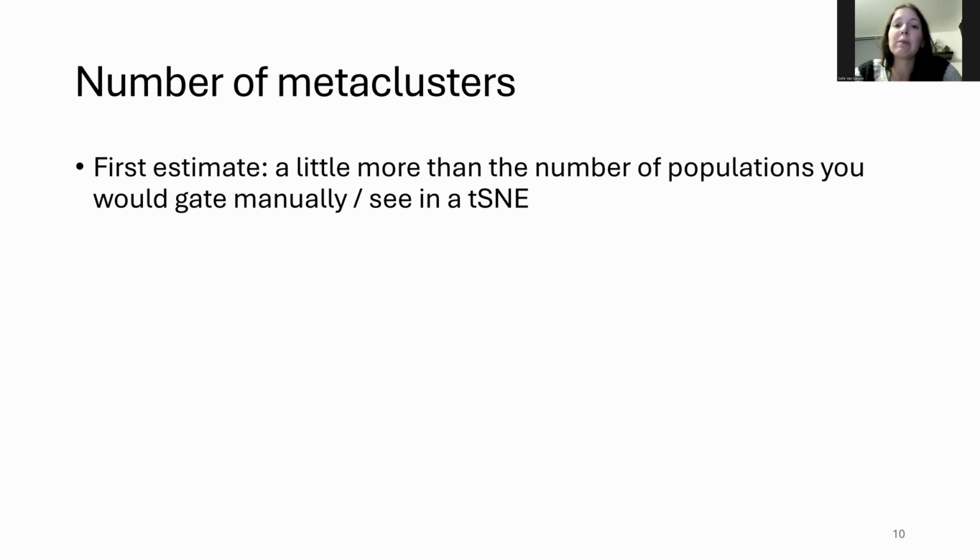Because there will always be some unexpected things that are also getting separated off. And it's much easier to merge some things together than to still have to split things after the clustering procedure. So even though it's in a less extreme way than the original one, I would still suggest over-clustering here.